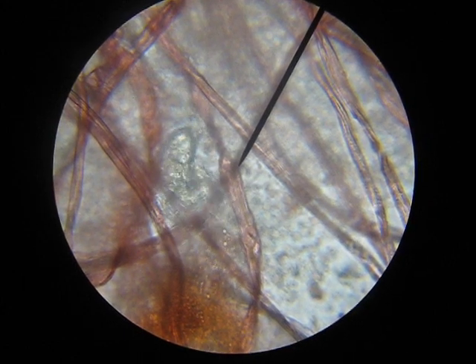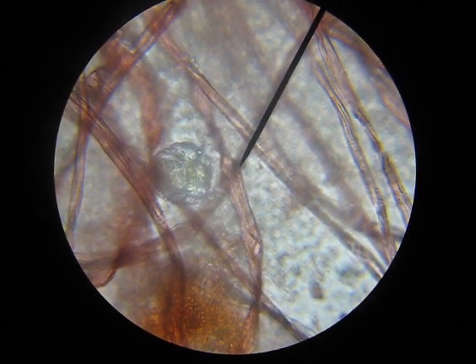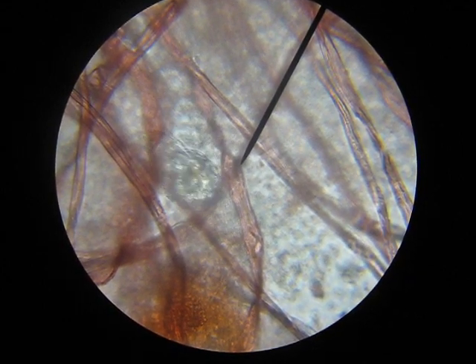There's yellow in it — it was just like red before, right? Yeah. I don't know what that is. And it was really eating. Or actually, I think it was eliminating waste the way it was just sort of pouring out.